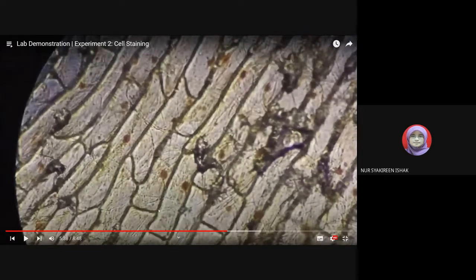Inside you have the cytoplasm, and then the central vacuole, but you cannot really see that structure as clearly as the nucleus. That is because the nucleus has components, it has chromosomes, so the dye will stain the nucleus. But the content of the central vacuole is mostly water, so you cannot see it really clearly, but you can see its effects. Here, the nucleus is at the periphery of the cell. This may be the region of the central vacuole, and these are the air bubbles formed.